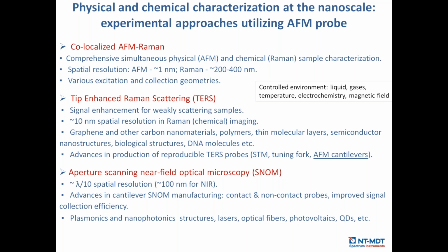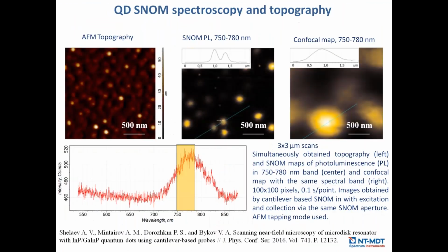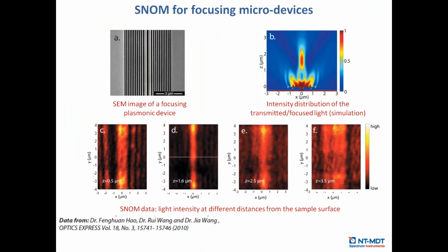So the first question, I think, is related to the slide with the cyanobacteria application. The question is, were you filtering in time to separate the fluorescence response from these cyanobacteria? It might be interesting to work in the same way with several fluorescent proteins. So as I understand, the question is, how did you collect the signal from these cyanobacteria?